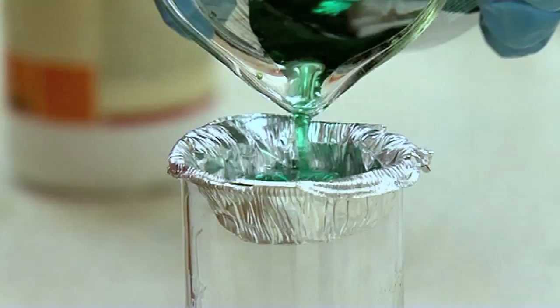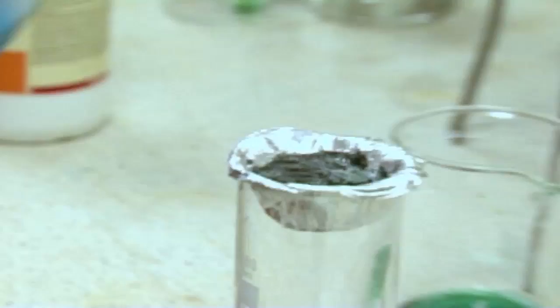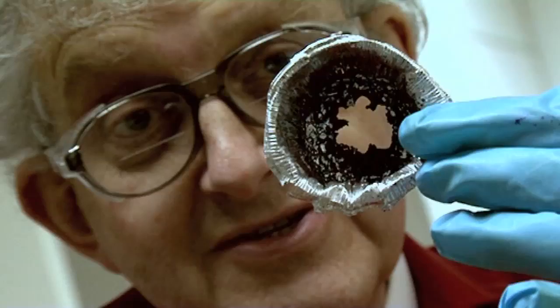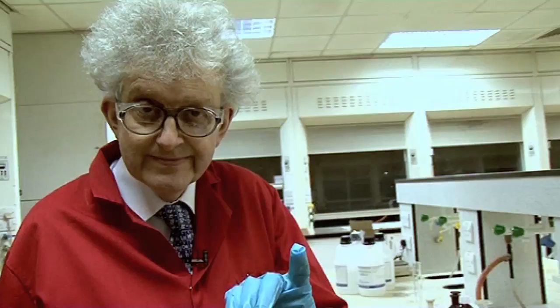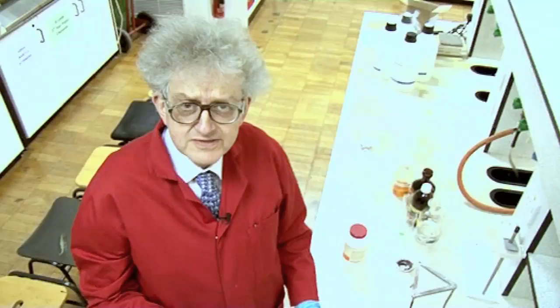I poured this in and, as you can see, nothing much happens to begin with. But then, if you watch, it starts boiling really quite nicely. You can see the nice precipitate of copper there. Now, imagine I was doing this for my children, who were quite small at that time — and whoosh, the stuff went through the cupcake holder, onto the carpet, and through the carpet. My wife was not at all pleased because there in the middle of our carpet was a hole. We now have a new carpet.